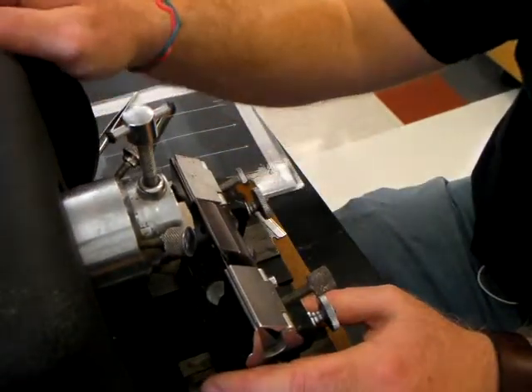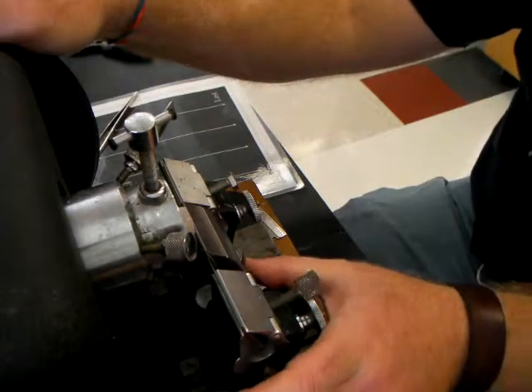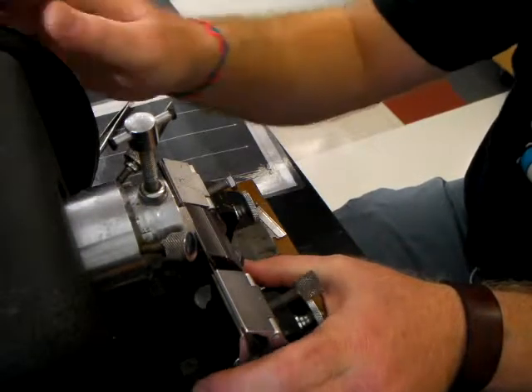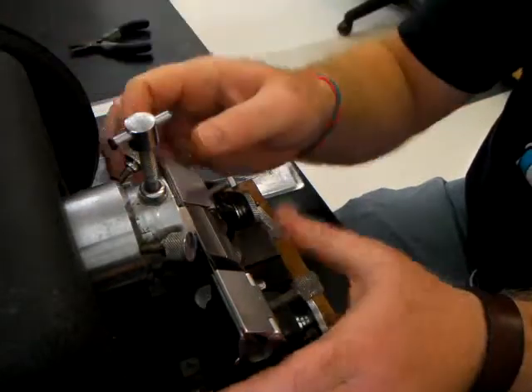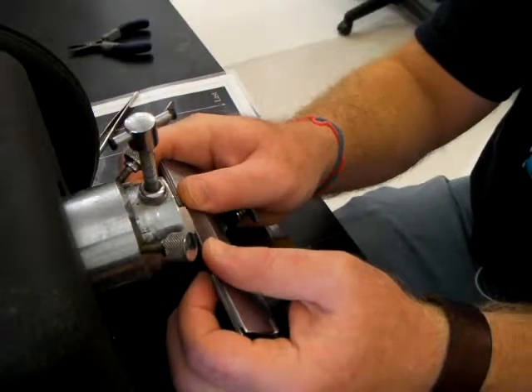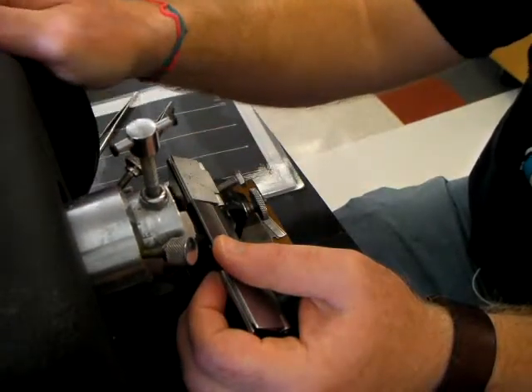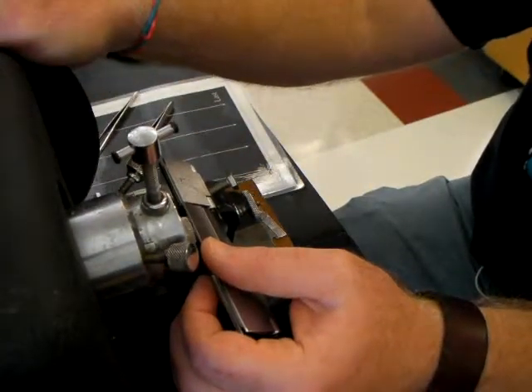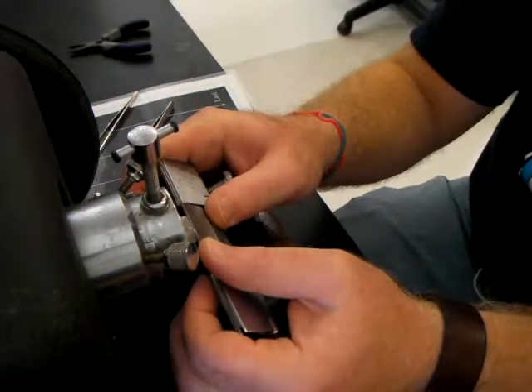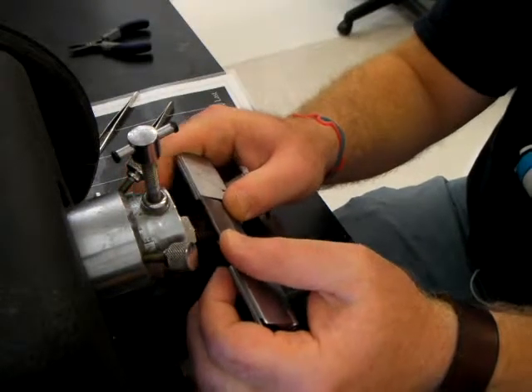Roll the specimen down to where the blade meets the block, just below the visible portion of the specimen. Push the blade into that portion of the block to mark where the blade meets the specimen block. Then roll the specimen further down and do the same at the top. These two lines must be parallel to one another with respect to the blade itself.